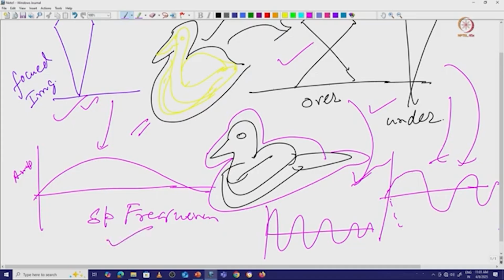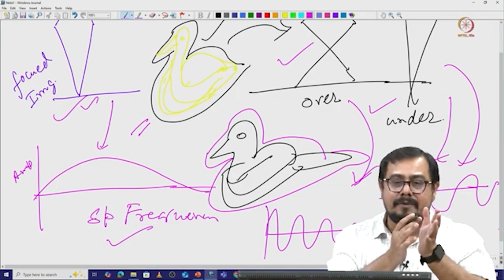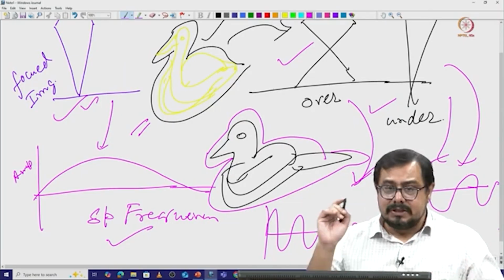At this moment, let us take a look at an actual scenario when we have a sample. I am talking about the black fringe and white fringe, and how we can distinguish those samples from the background. So this is very important.